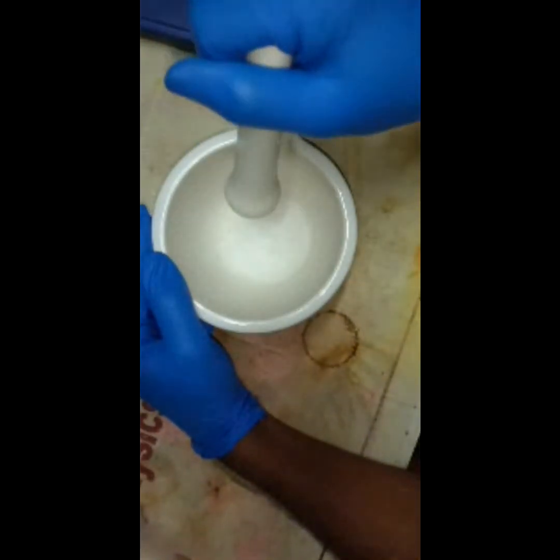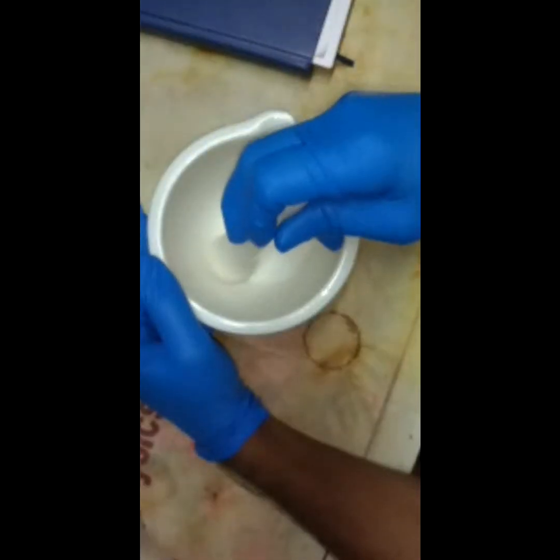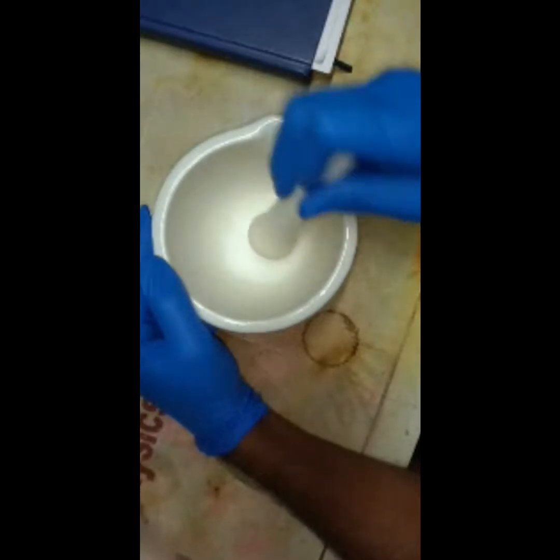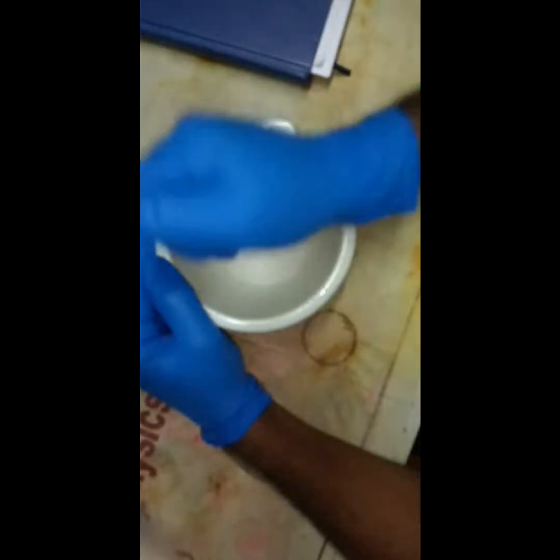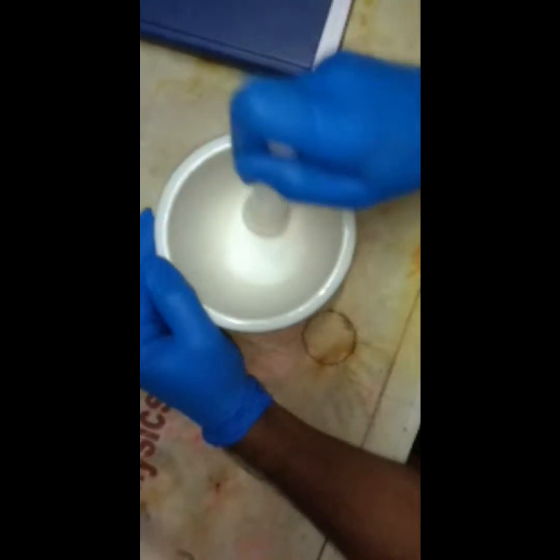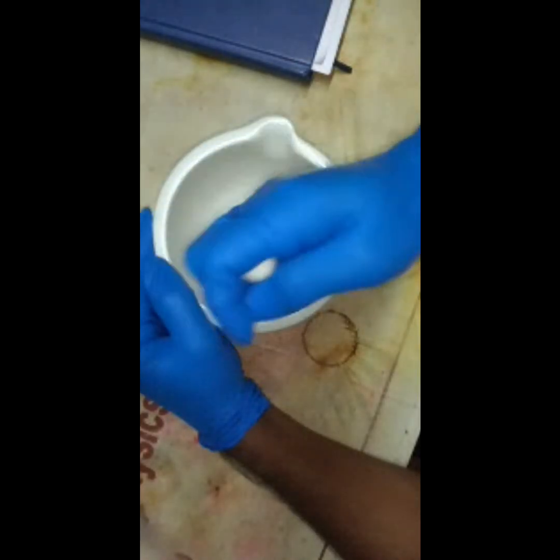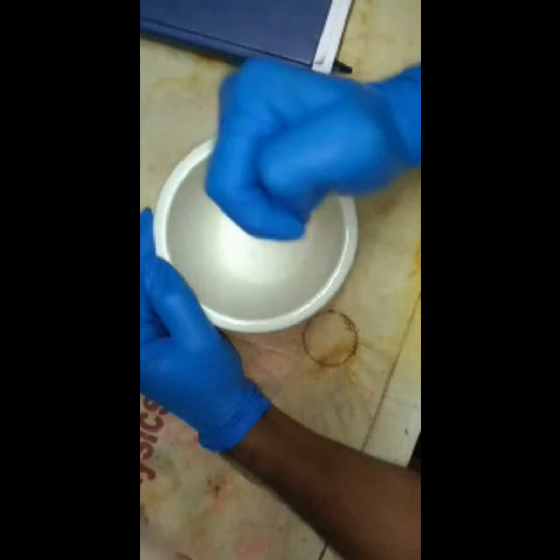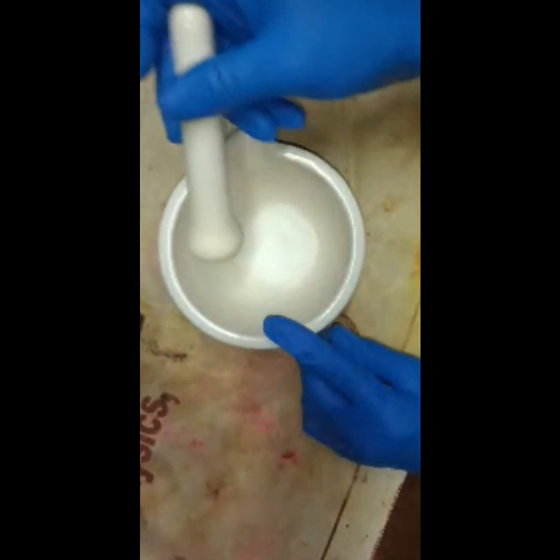So we are starting to grind the particles, to prepare the samples. We are grinding the samples.